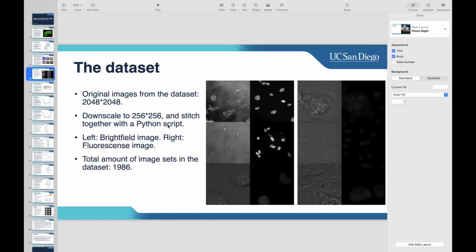And you chose to reduce the resolution versus just a smaller field of view because why? Because I think either will work, but I'd like to preserve more cells to show, maybe that will bring a better result. But yeah, I think either will work. Okay.